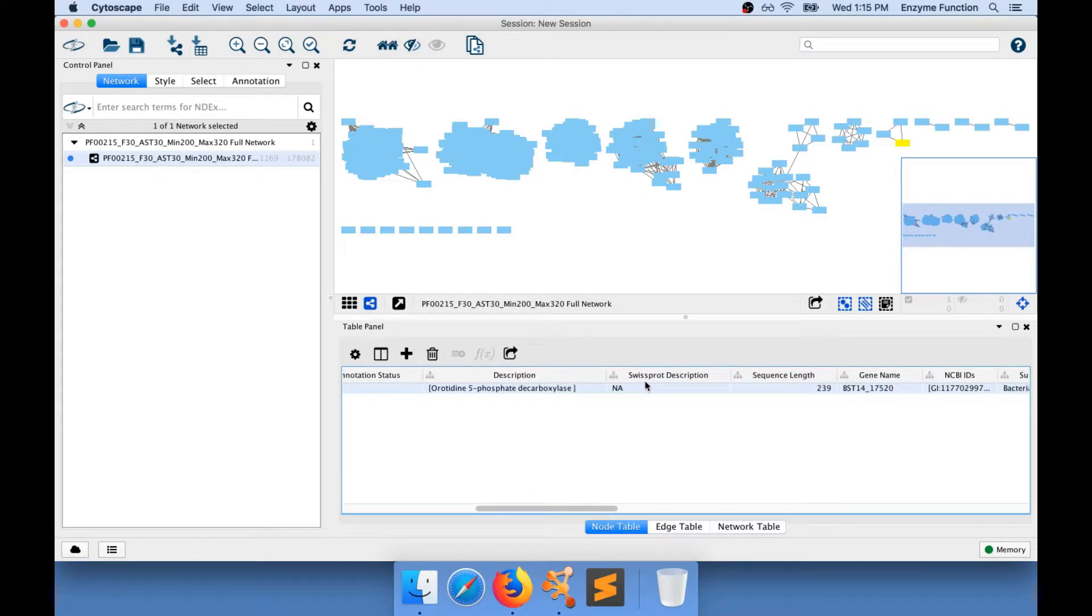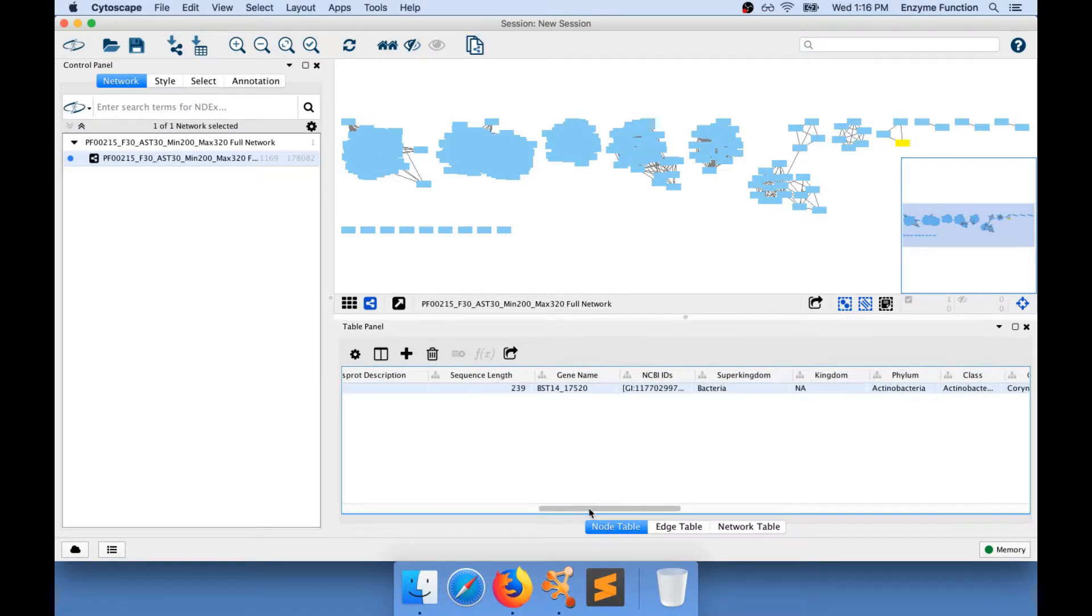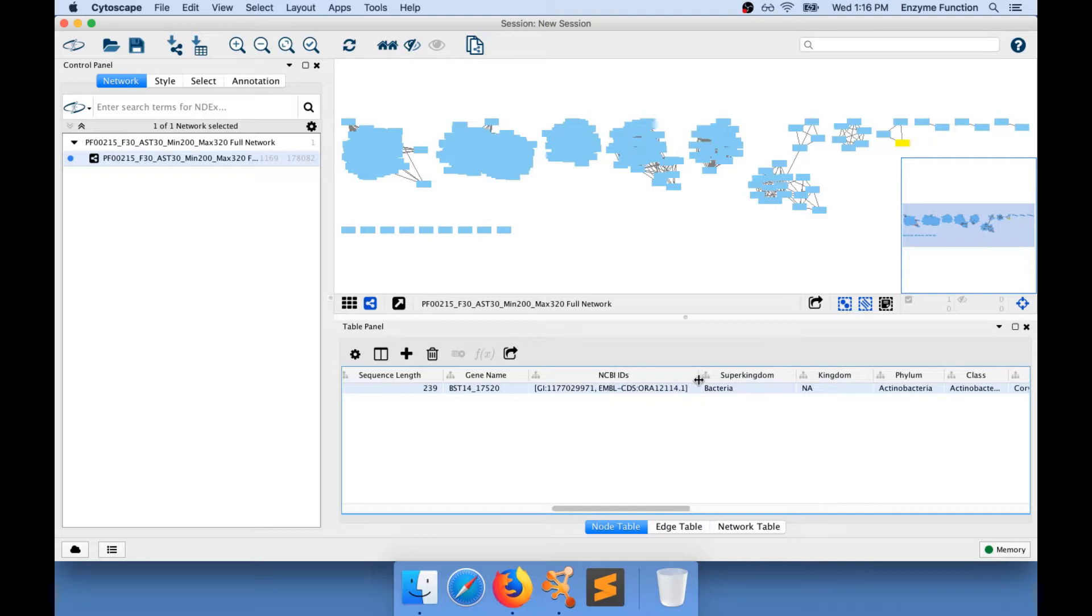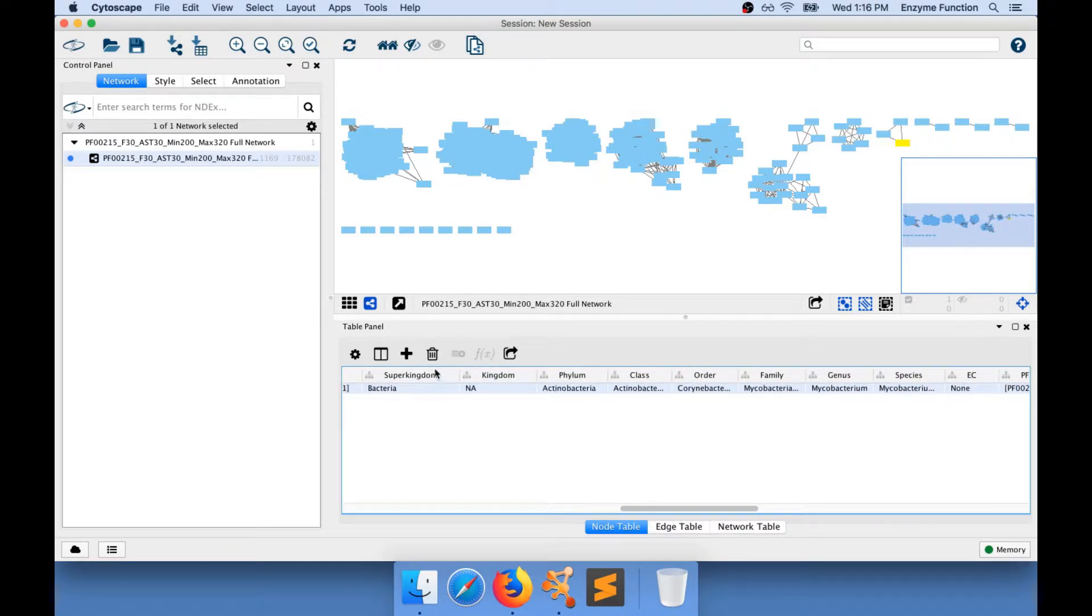it's not a SwissProt description, so the SwissProt description is not available. We have the sequence length, the gene name, some NCBI IDs, and we know it's from bacteria, actinobacteria, and so on.